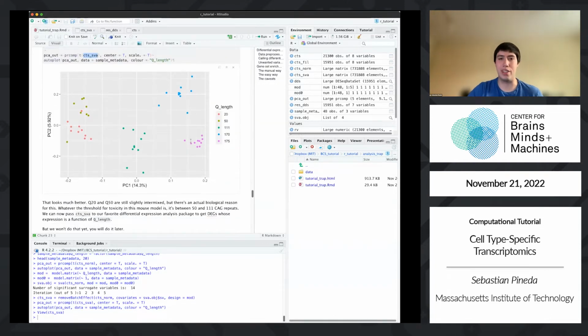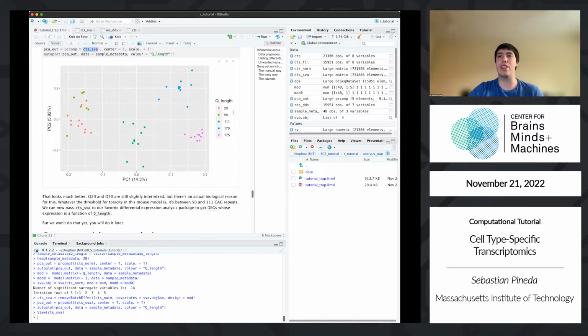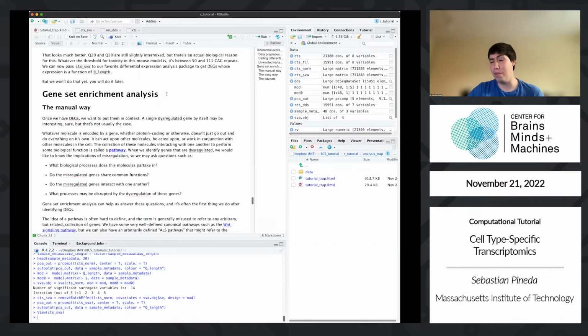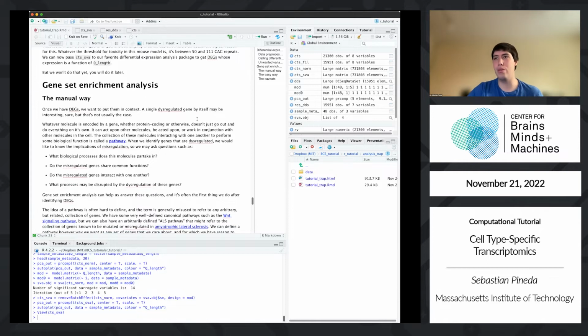If the data is really dirty, if there's a true outlier somewhere in there that's driven by something very extreme, this doesn't work. But if your data just looks a little bit off, these are the kinds of techniques that you can use to salvage it.